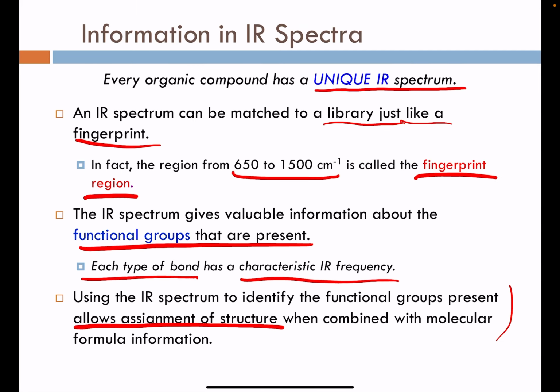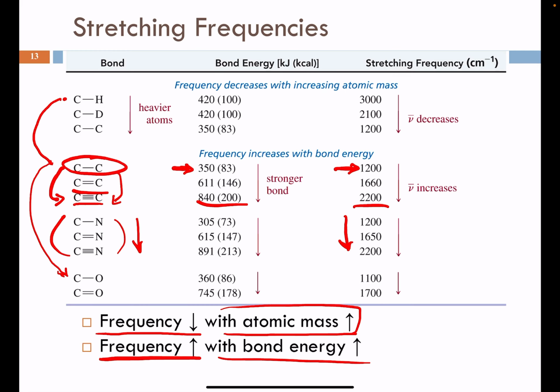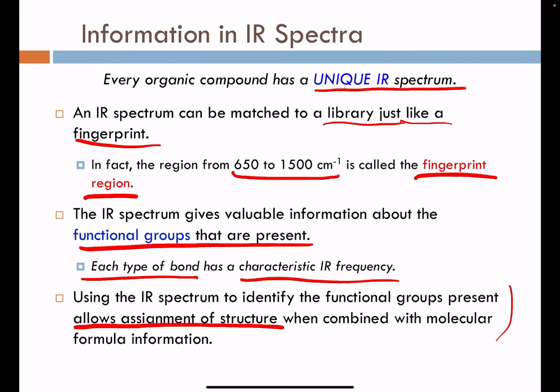or simply polystyrene. So if we rewind, here you can see that that CN triple bond should be found with a stretching frequency around 2200 wave number in the IR. So if a signal is found here, we must be dealing with a nitrile-containing polymer, like styrene co-acrylonitrile polymer.